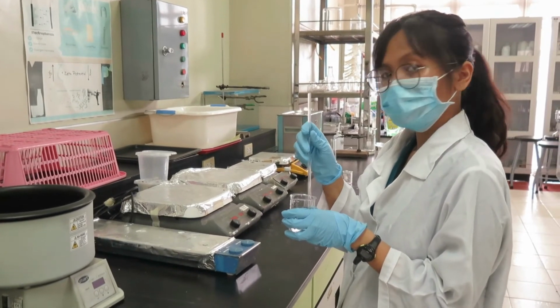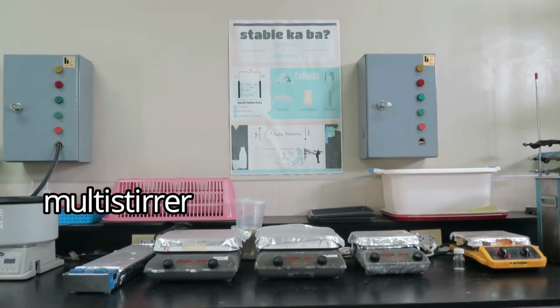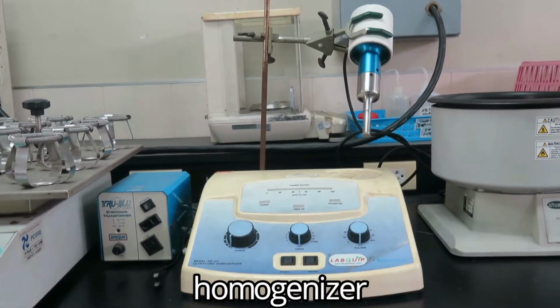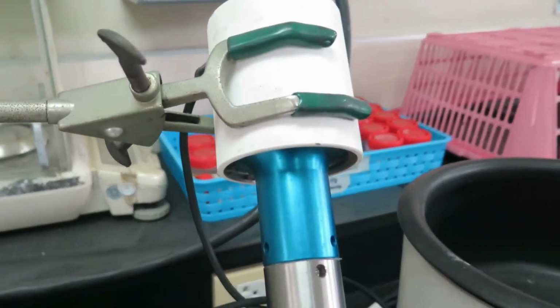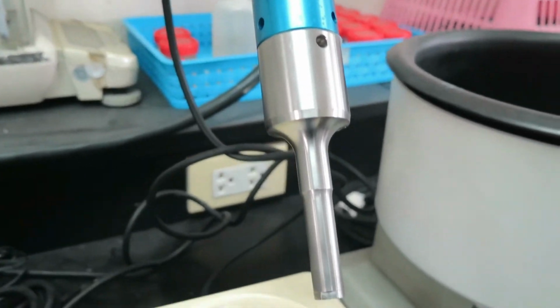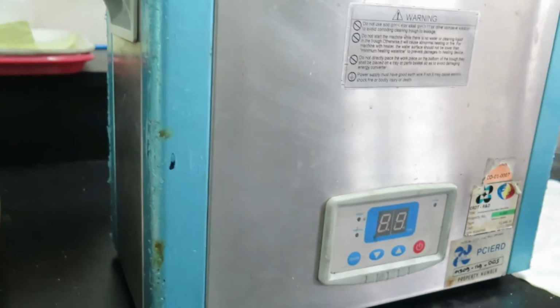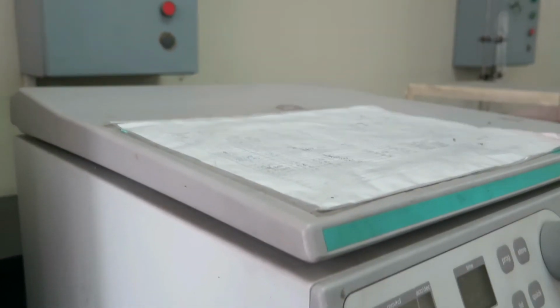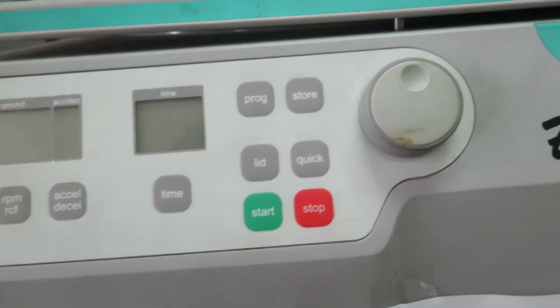Do you really want to mix your solution manually? No. So you use the hot plates, or the multi-stirrer, or maybe the orbital shaker for adsorption experiment. Homogenizer, sonicator. Where do we use this equipment? Well, you use this equipment for homogenizing your solution. We also have a centrifuge. This is used if you don't want to wait too long just to separate the precipitate from the liquid.